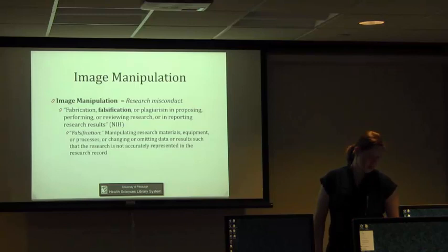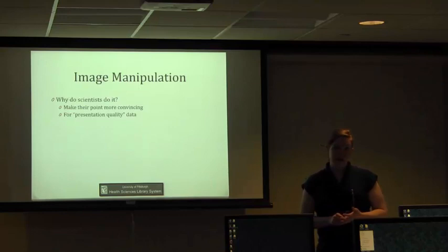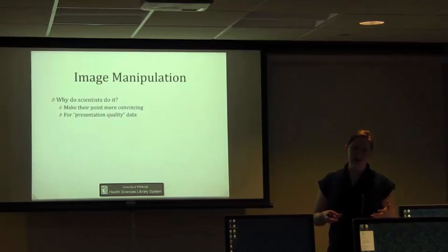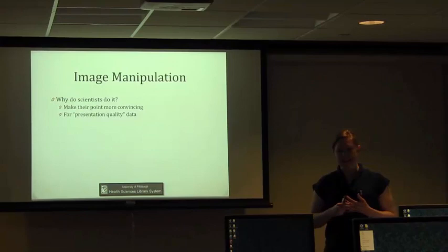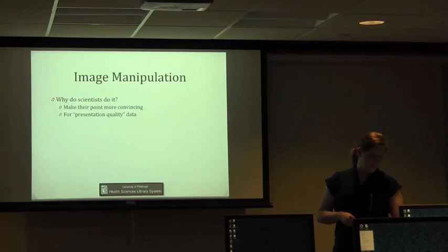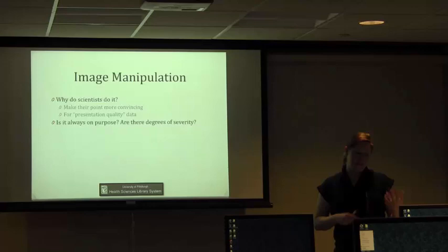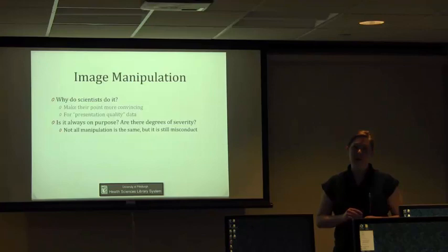Why do scientists manipulate images? Two main reasons are to make their point more convincing. A lot of people say things like, well I knew that was the result but it wasn't quite clear in my data and the scientific assumption of knowing what the results are despite what the data says. I'm sure you all heard that but it's actually not very ethical. Also, people do manipulations for what they call presentation quality data. So the things that they want in the paper.